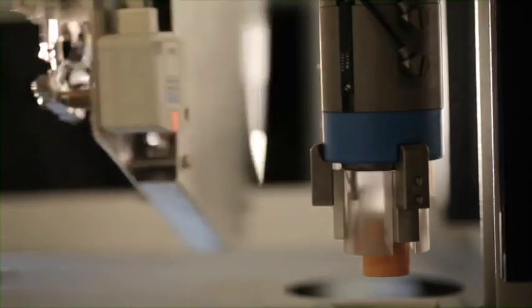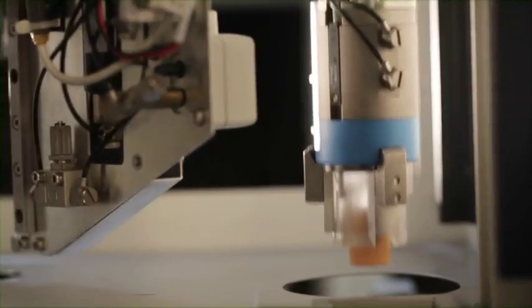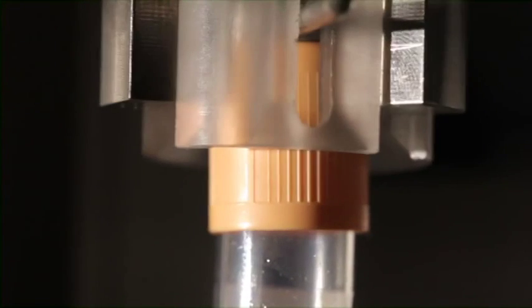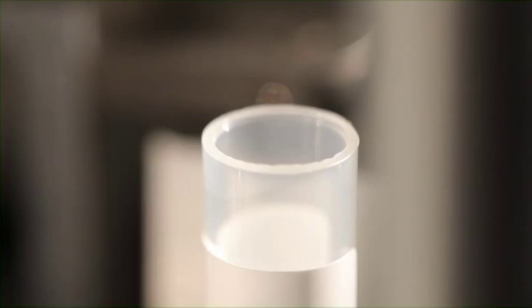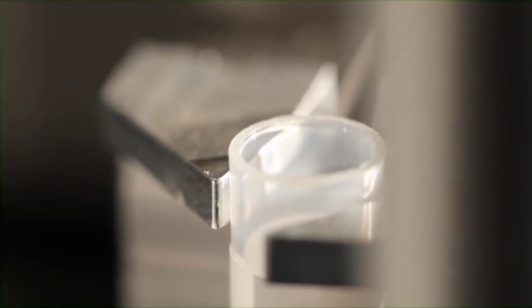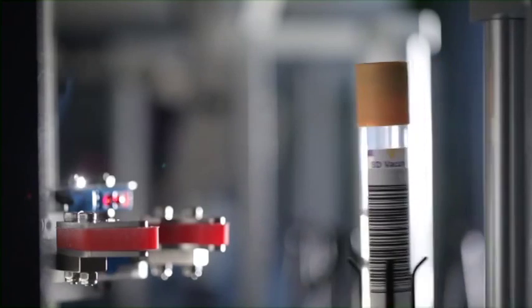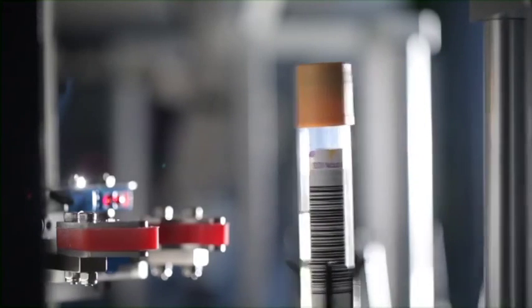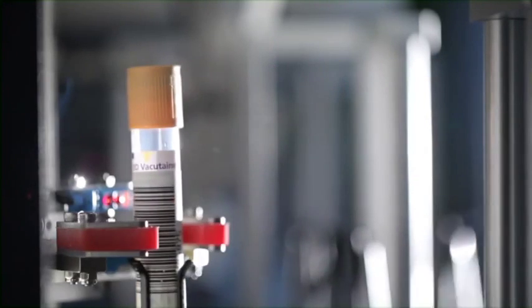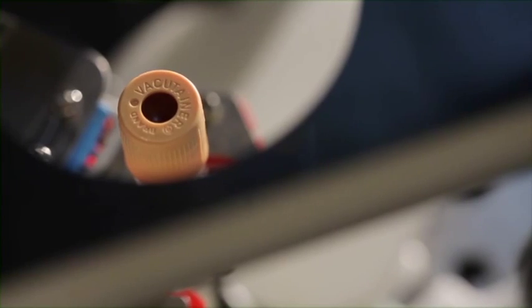A capping module to cap both primary and secondary tubes can be included as one of the function modules, as can a dedicated decapping module if a faster decapping throughput is required.